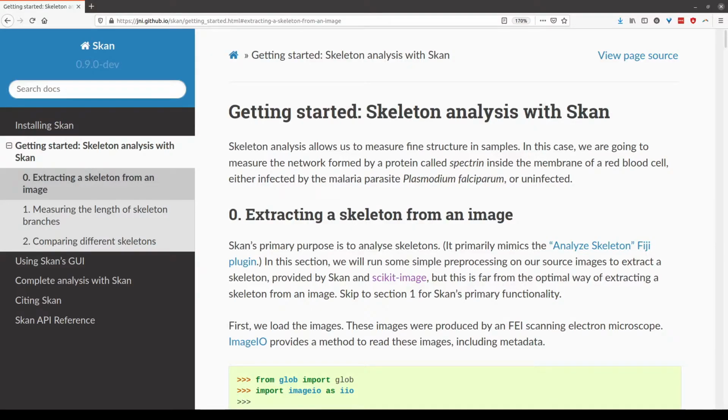While a lot of the first stages worked really well, once we got to the final analysis stage where there's a reduction, we're taking each of the image chunks and computing the branch statistics. The type of result we get back from that is not the same shape as the image chunk that went in, and that was causing a bit of a problem. The second problem we ran into was that the skeleton analysis library I chose to use, called Skan, written by Juan Nunez-Iglesias, works really well for a single skeleton volume, but it wasn't written in a way such that the internals were compatible with distributed analysis.